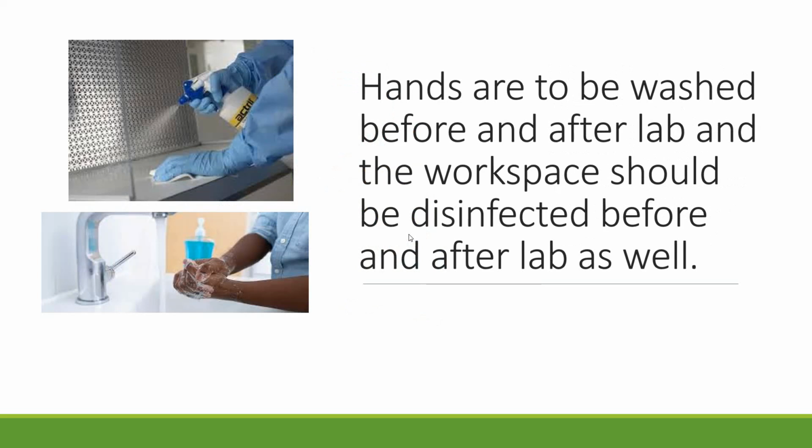When you walk into the lab after you put things down, and even many times before instruction happens, students are instructed that after they set things down, the first thing they do is wash their hands and glove up. And why is that? Because they are removing any contaminants they may have on their hands. Gloving then will protect them for the duration of the lab, and that helps keep them safe. And then they walk to their workbenches, and they spray them down and disinfect them.